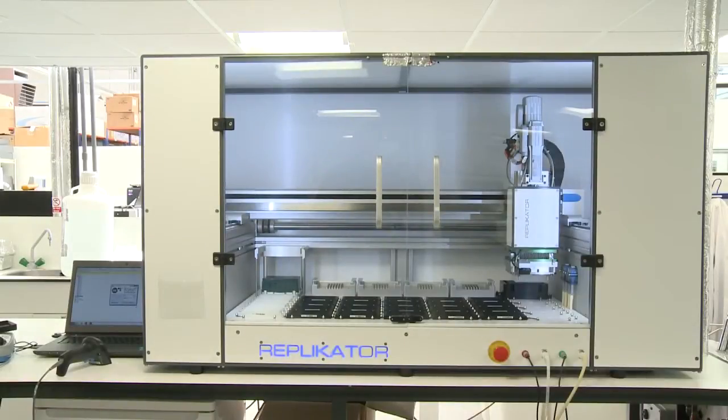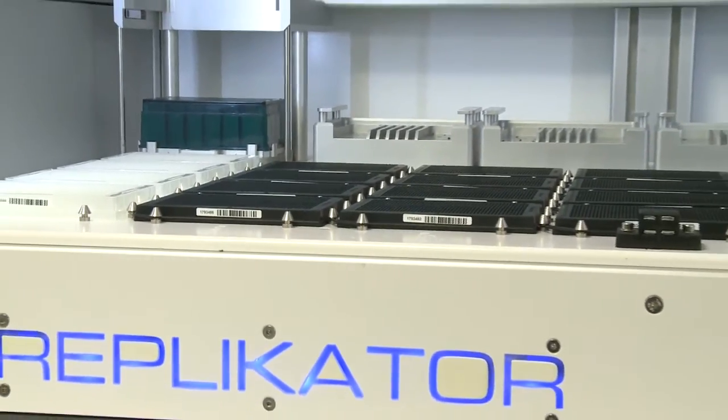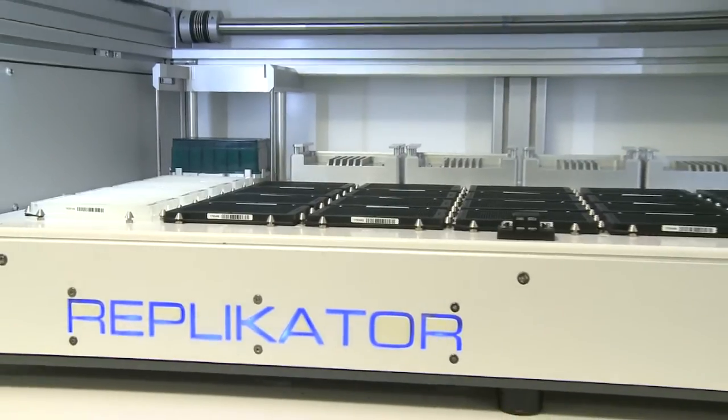Hello and welcome to the family of next generation fully automated liquid handling platforms from LGC. The Replicator robotic system is a fully automated liquid handling station that quickly and accurately arrays DNA or any other liquid in a format that's convenient for your workflow.